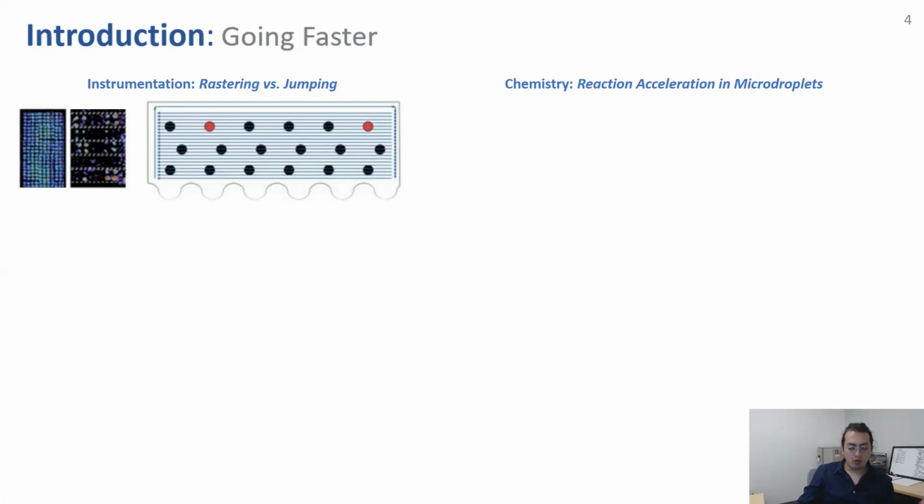So what do we do? Well, we can take the positions of this array that we created, because we created it, so we know that the positions are fixed within the array. We just need to calibrate the corners of the array. With that, you can create a virtual grid, and you can just move through any of the positions on the grid. You don't have to go to all of them. You can select which ones to go.